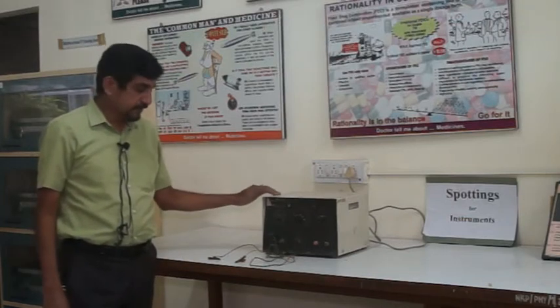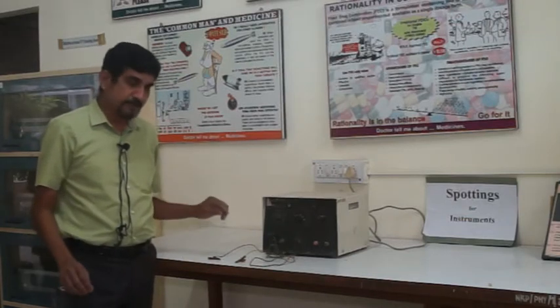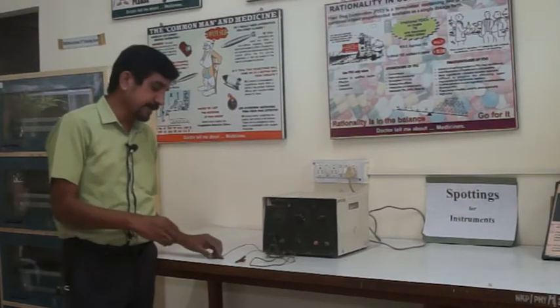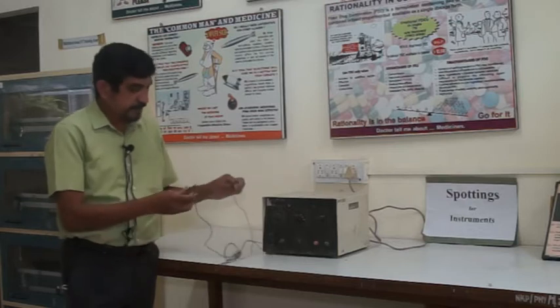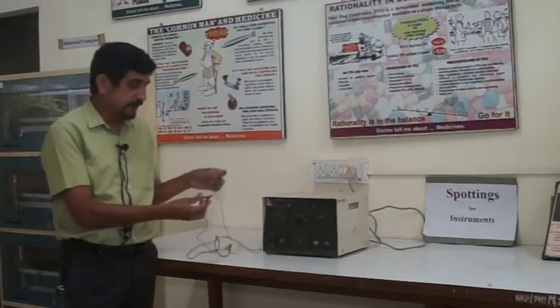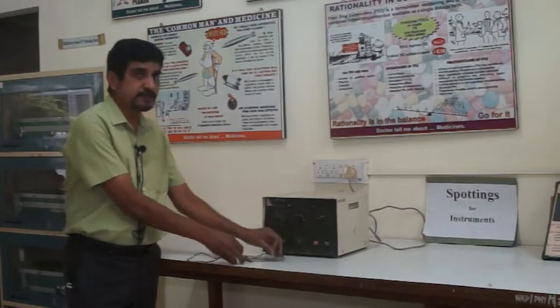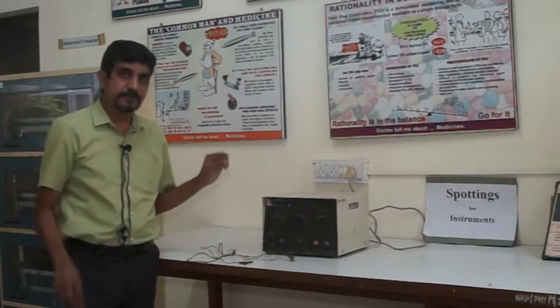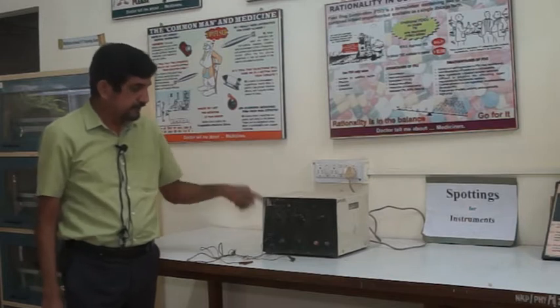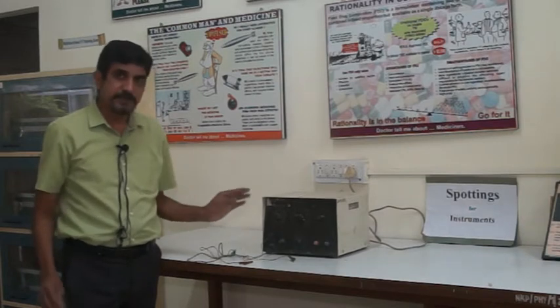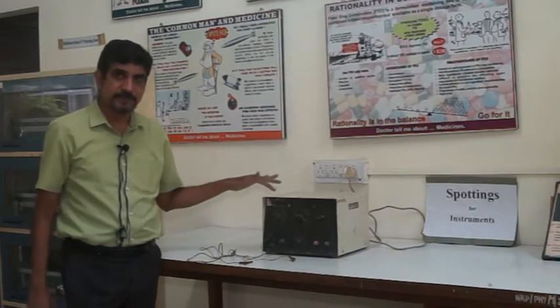This is a convulsivometer. It produces convulsions in rats or mice. These are the electrodes. These electrodes are attached to the external ear of the rat or mice, and when we switch on this instrument, it produces convulsions.